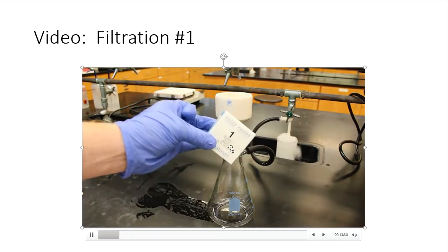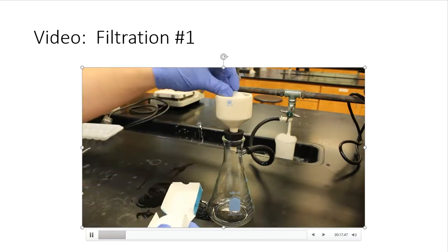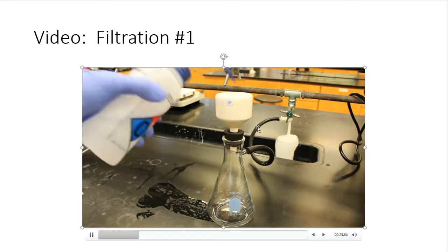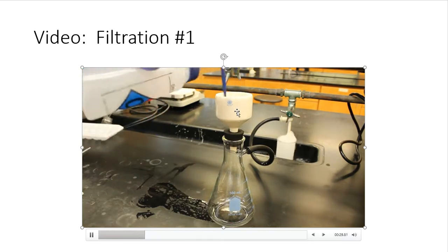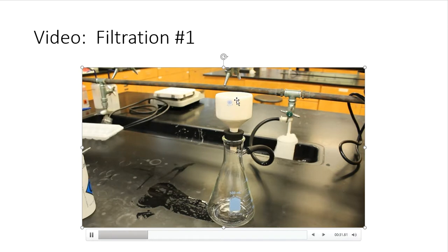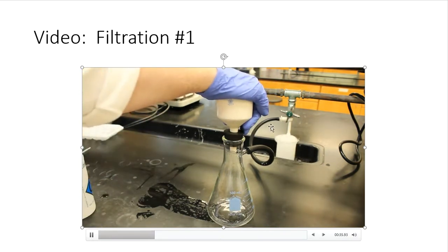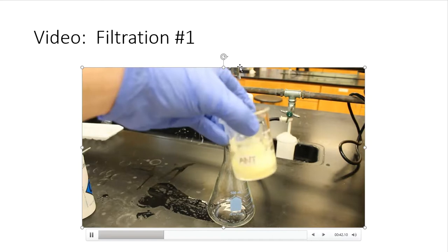So there's the filter paper. Grade number 1 Whatman is what we decided to use. It fits the Buchner funnel perfectly, so in it goes. Then I'm going to pre-wet the filter paper to do what we call seat the filter paper. That way it stops up all of the holes in the Buchner funnel. That's me checking to make sure I've got suction, and I do. And now we're going to pour through.